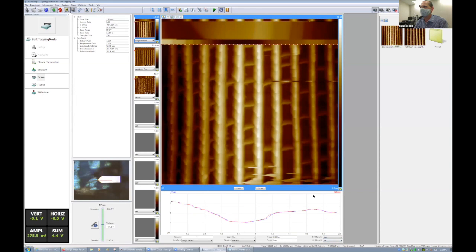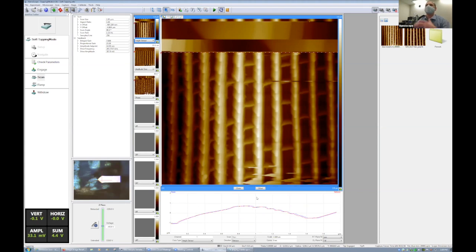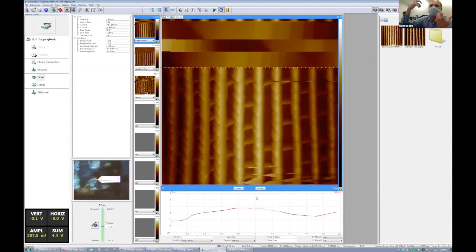Oh, and Dustin has another good question. How do you feel an atom? What are you feeling? So there's 2 things. One thing is atoms have electrons, right? Those electrons create a charge around them, so you do have short-range Coulombic repulsive interactions. If you bring 2 atoms together, they're going to start pushing against each other. This is the repulsive force. That one is a very short-range force, but it's a very strong force.